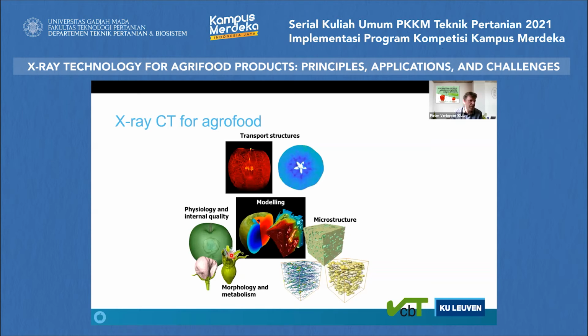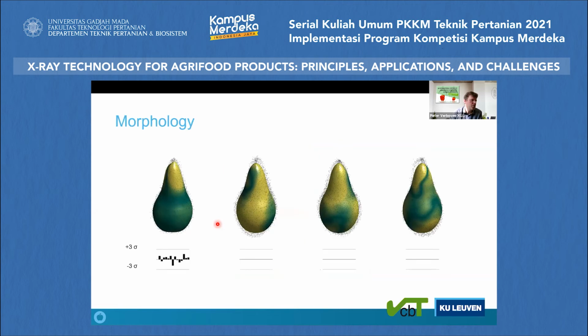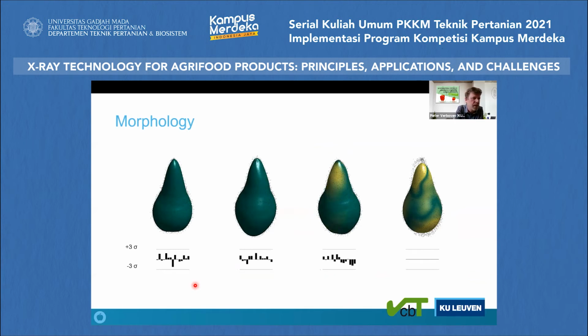And then finally, it's about internal quality, having instruments for non-destructive measurements and so on. So starting with morphology, X-ray will allow us to measure morphology of products very well. Here are examples of different fruits. They have different sizes. They have different shapes.